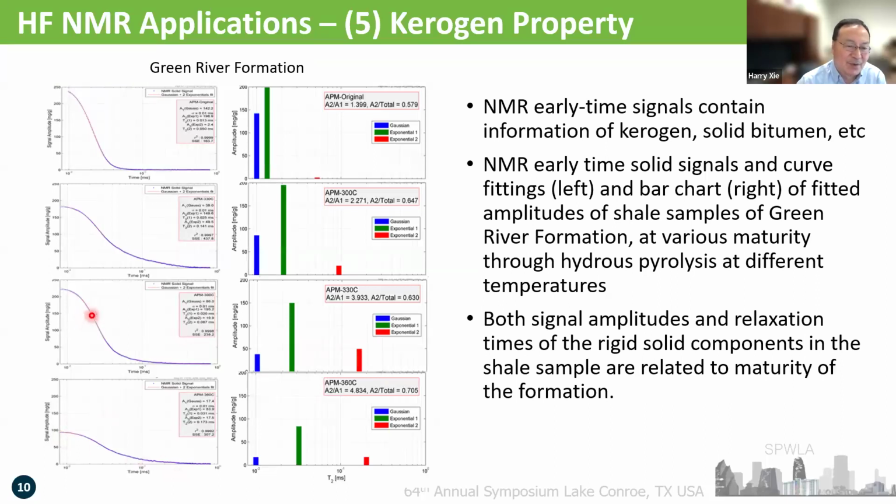So this is not a normal NMR T2 measurement. Instead, it's an early time decay, specifically for so-called short T2 components. If you look at these T2 components, this is about 10 microseconds. This is less than 0.1 millisecond. This is 0.1 millisecond. So 10 to 100 microseconds. The maximum here is 50 microseconds. So 10, 20, 30, 40, 50, this kind of region. So they are very short T2s.